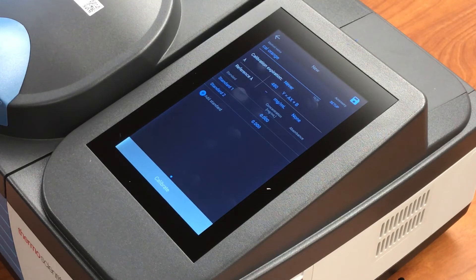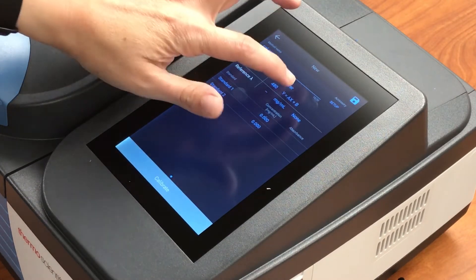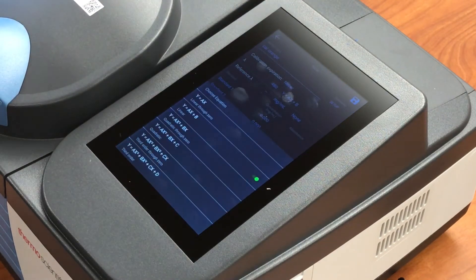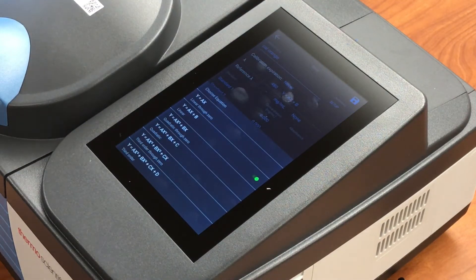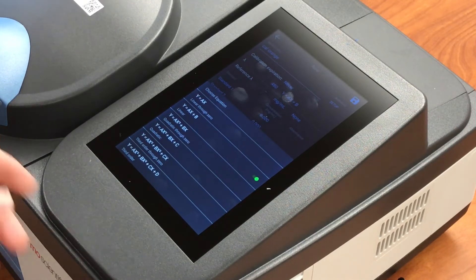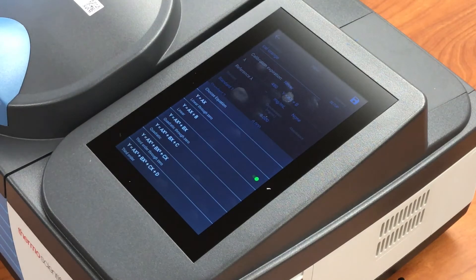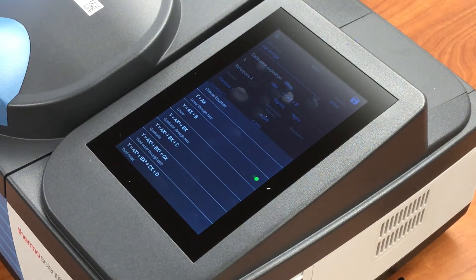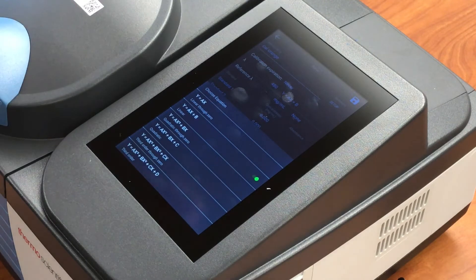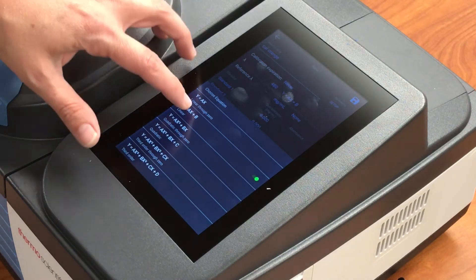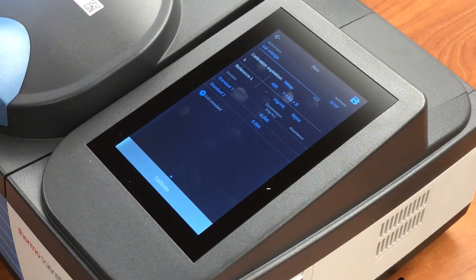We can then select a calibration equation, or basically how we're going to fit our data. We're going to do a linear fit with an intercept, so y equals ax plus b. That's going to be the most appropriate for our use.